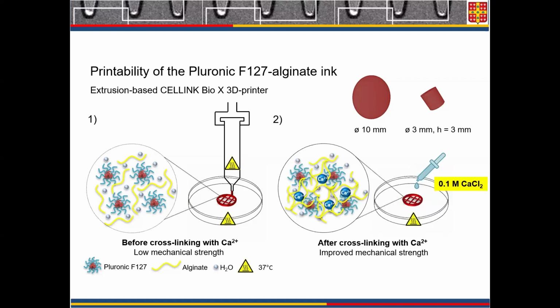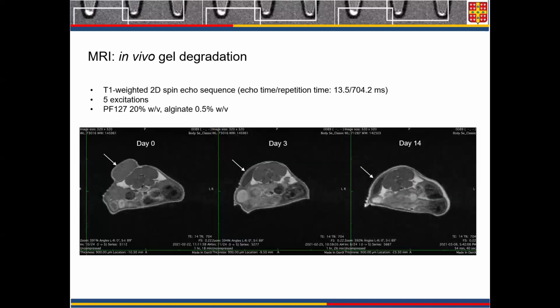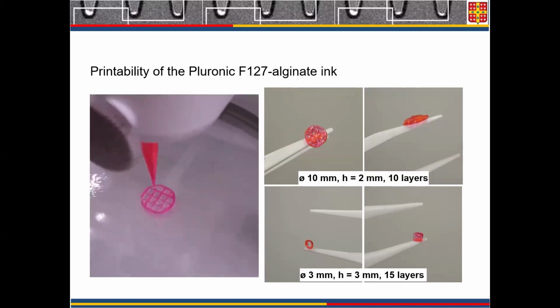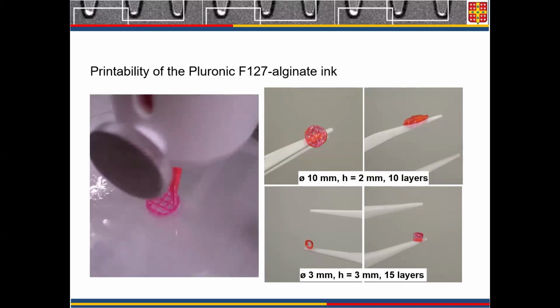And if you look at the current trend in pharmacology, there are more and more papers on 3D printing in the field of pharmacology. There's a very interesting increase in the number of papers and possibilities. So for the sake of time, I will stop here. So we characterized the materials. Here you have an example of the 3D printing process with the CELLINK printer that we have in the lab. You will see it in action this afternoon.